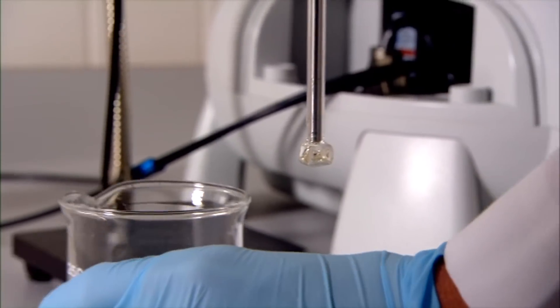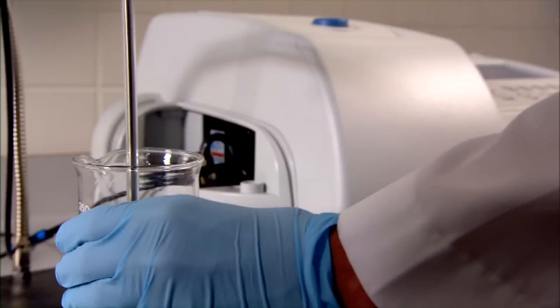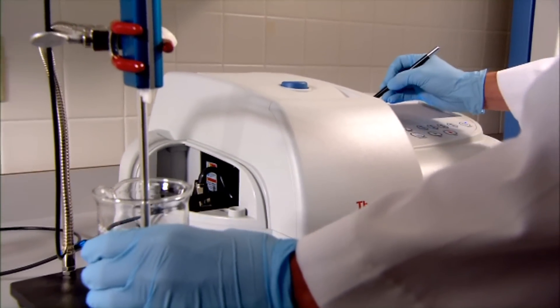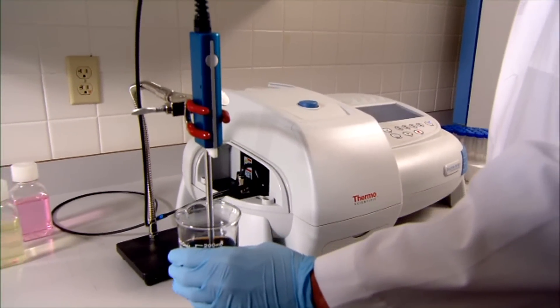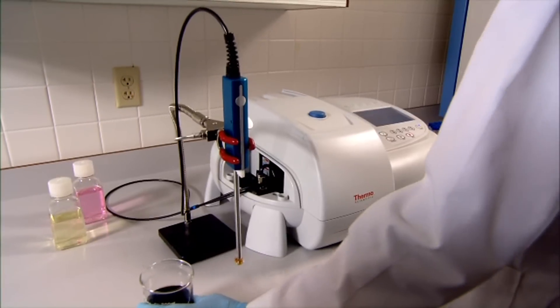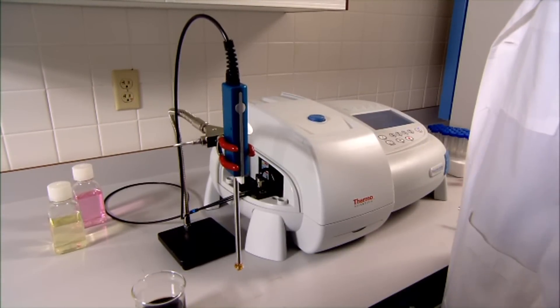Proprietary application focused beam geometry technology that optimizes the optical configuration of the instrument to your applications and maximizes performance from micro cells, solid samples, or fiber optic probes.